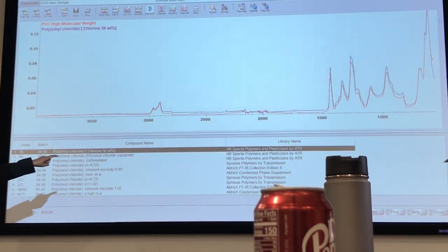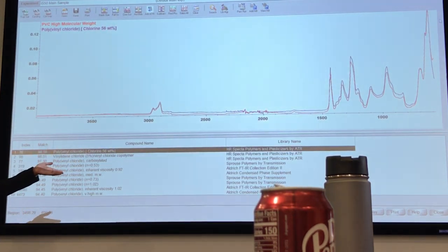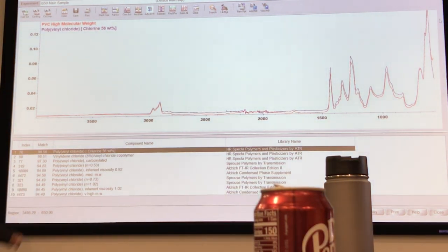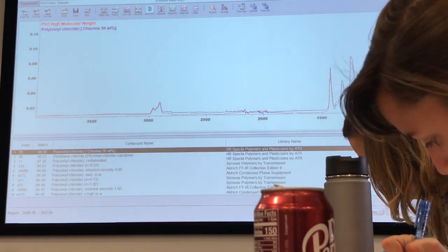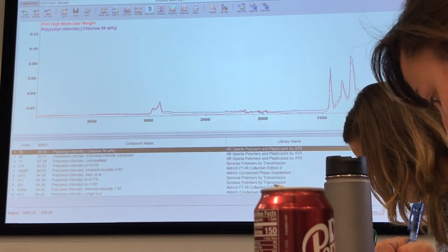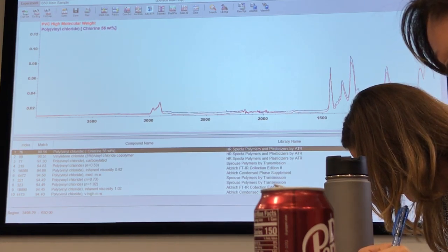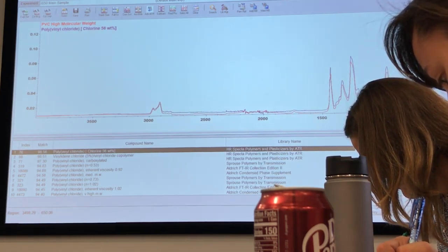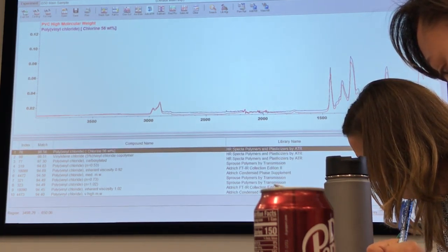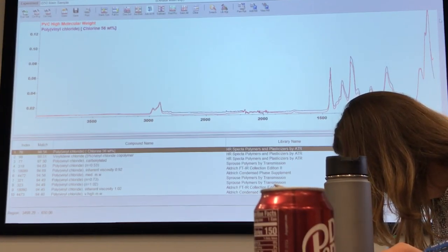But you also look at where my library is from. This is a library that was created with ATR. And in the beginning, I said the spectrum is an ATR spectrum, right? So in your case, depending on what type of samples you have, some labs will be doing a lot of ATR and creating their own ATR libraries. If you are doing ATR and creating your ATR libraries, perfect, no problem at all. But some folks will not have the flexibility to do that. They may have just the commercial libraries and they will be just running ATR.